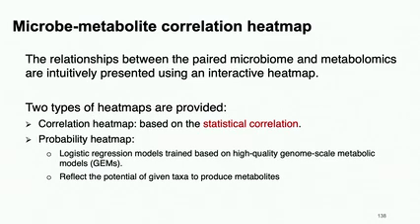So we can combine both of them, statistical correlation overlaid on what we can predict. You think they are correlated statistically, these metabolites and microbes co-appear, but are these microbes actually most likely to generate these metabolites based on the GEM genome scale metabolic model? When you have two pieces of evidence, one from your data correlation, one from your knowledge-based prediction overlap, the confidence is higher, right?